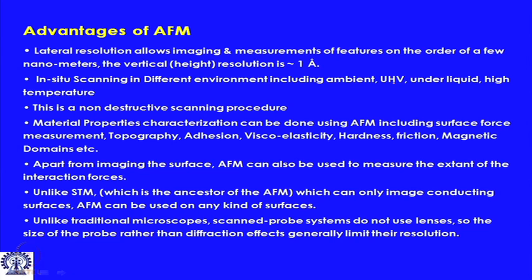Then, in situ scanning in different environments including ambient, that is the most important thing. If you are talking about any other high end microscope like a scanning electron microscope or a transmission electron microscope, they work only in high vacuum. You need a significant vacuum so that the electron beams do not deviate because of collision with air molecules. In AFM, nothing is needed.